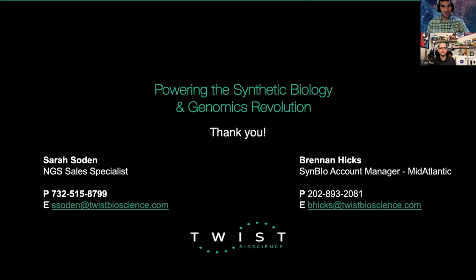I got a question to start with though. You did mention using the probes for enrichment for like 10x sequencing and things like that, which is awesome. But have you also used the probes for depletion with a 10x workflow to remove things like ribosomal content or unwanted genes, so that you're really capturing things that are more of interest?